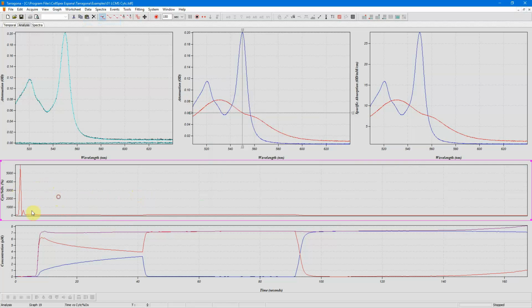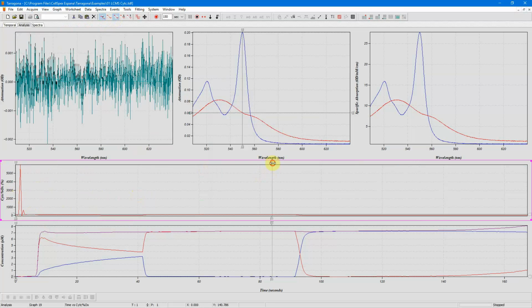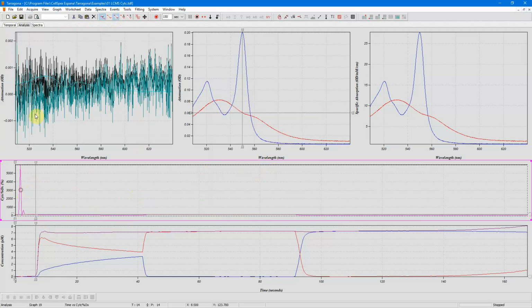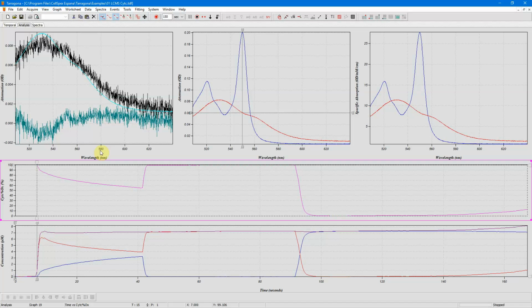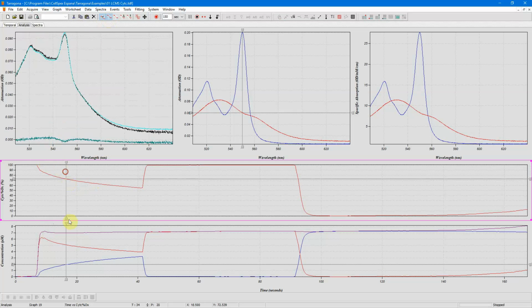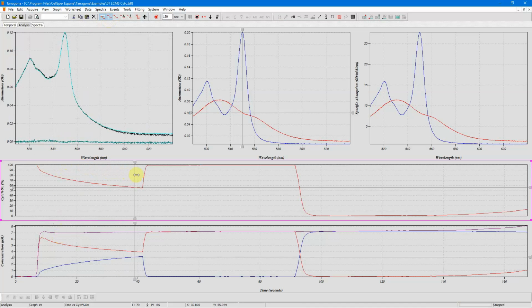And I'm going to clear this data out because this is when I don't have any cytochrome-C. So when you don't have any cytochrome-C, you can't have an oxidation state. So I'll start it here. So data clear, and then I can rescale that. So now I can see what's happening in my experiment. It goes in, and I have about 7 micromolar of cytochrome-C, and it starts to reduce. And then I add the ferricyanide.